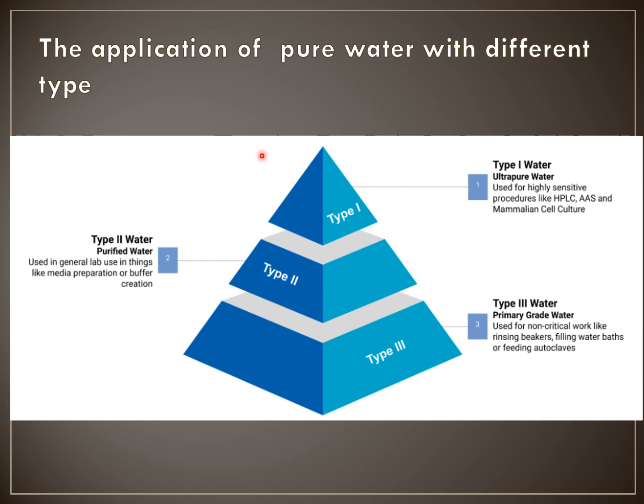After we are clear about the capacity of the purification system, we need to be clear about the level of pure water we need our instrument to provide. To choose the suitable purity of the water, we will follow the application area of our application.